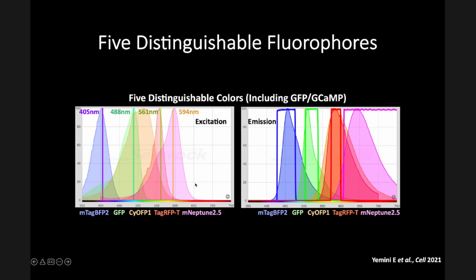Now, all that said, there is a really nice technique which I've wanted to try out from Rohi Yasuda, who I don't know where he's at now. I think he's at Max Planck in Florida. I talked to him, which is called FLIM, Fluorescence Lifetime Imaging. Now, instead of relying on these filters, you excite, and what you really care about now is the lifetime of the fluorescence in nanoseconds.